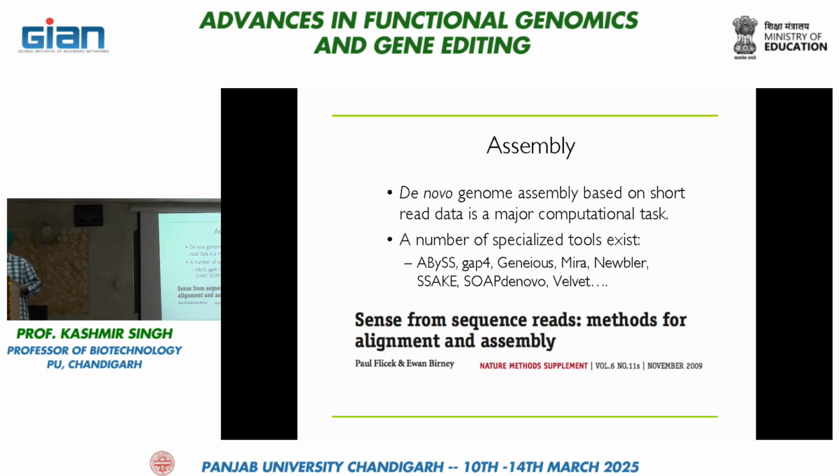Okay. Then you want to do assembly. After checking the quality of the sequences, you want to do assembly of the sequences. Now we have seen the parameters that are ideal for sequencing. Then you have trimmed the adapters, and then you have trimmed the sequences that have low Phred score, and then you want to assemble the data. So if again you are using Trinity software, it automatically does everything.